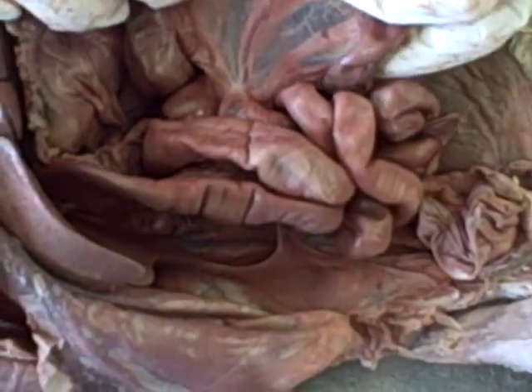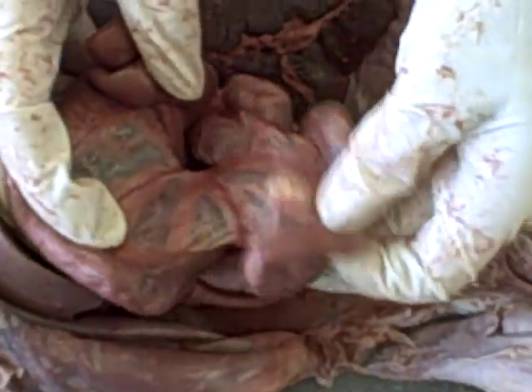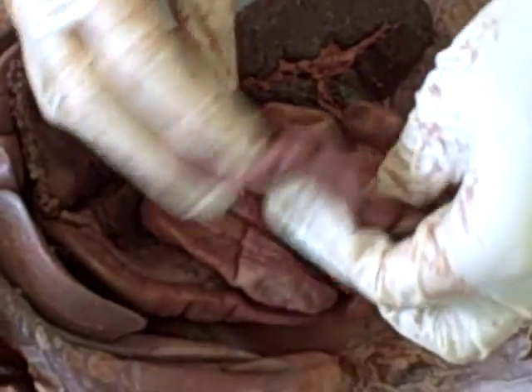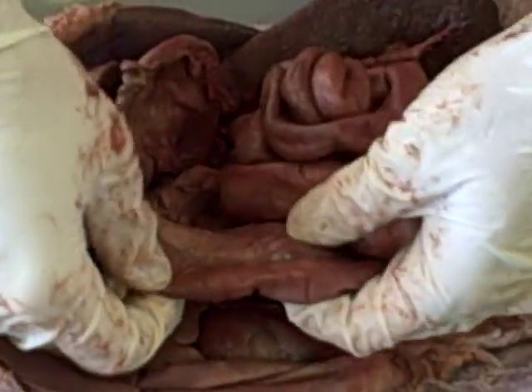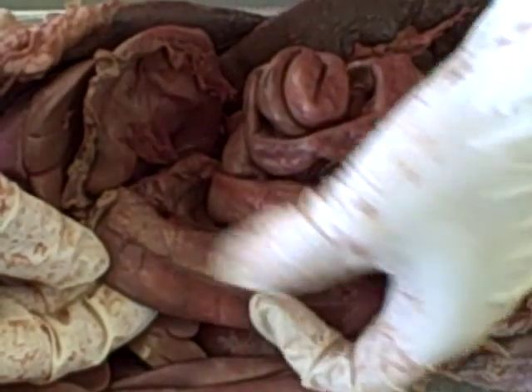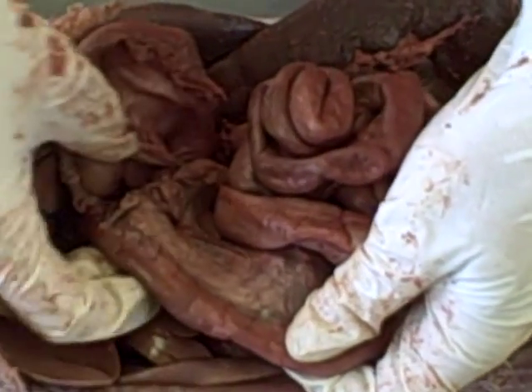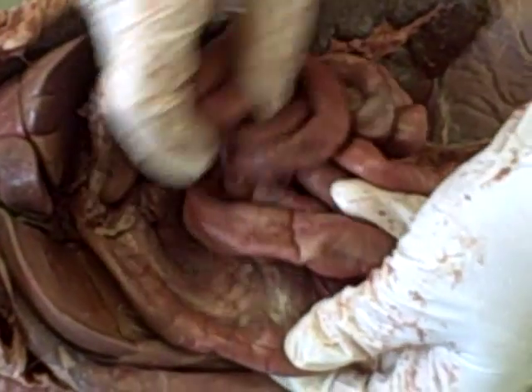You can note that there is vasculature to allow for the absorption of the nutrients here. There's going to be more secretion, but all the absorption of nutrients is going to come via all these blood vessels. Where this large J-shaped organ meets the small tube organ, there's some tissue right underneath here. It is glandular tissue. It has a secretory function. It's going to secrete stuff. I can't tell you what stuff, but it's right after this large organ where it enters this small, long tube.